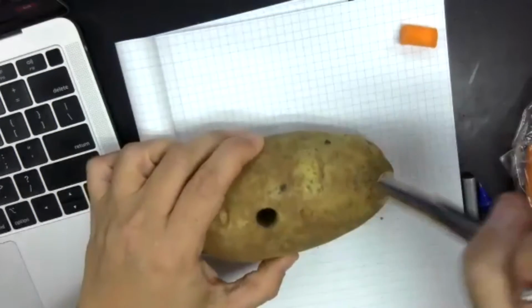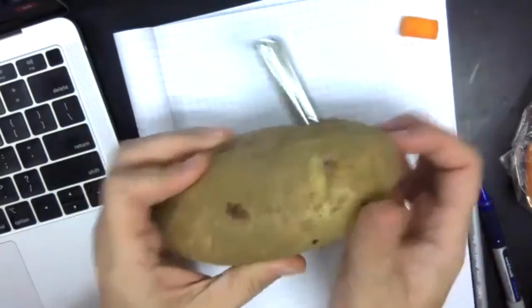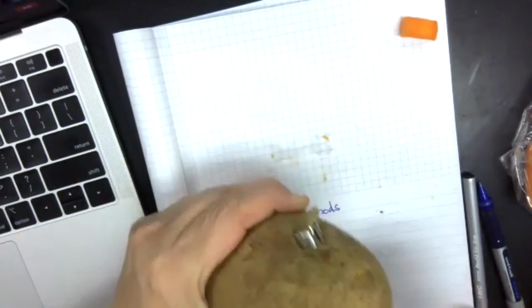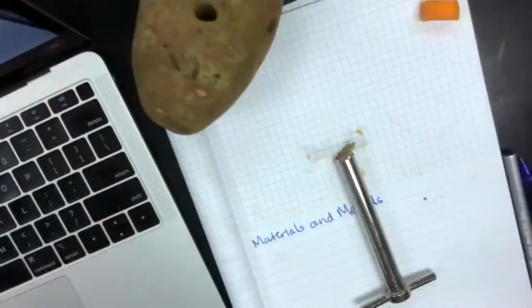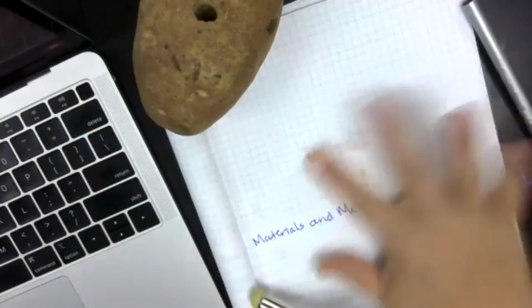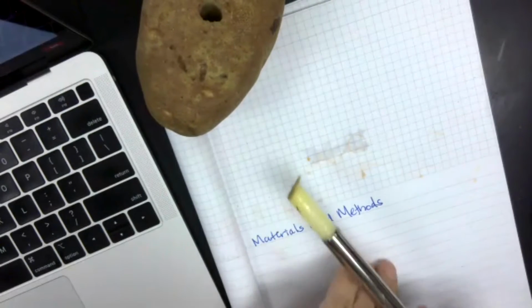Anyways, so you're going to core the potato, and be careful that you keep your fingers away from the corer. Then you're going to pull that core out, and it's okay if you get a little bit of potato juice on your notebook. That's a sign of a good scientist. I'm just kidding. And you push your core out.